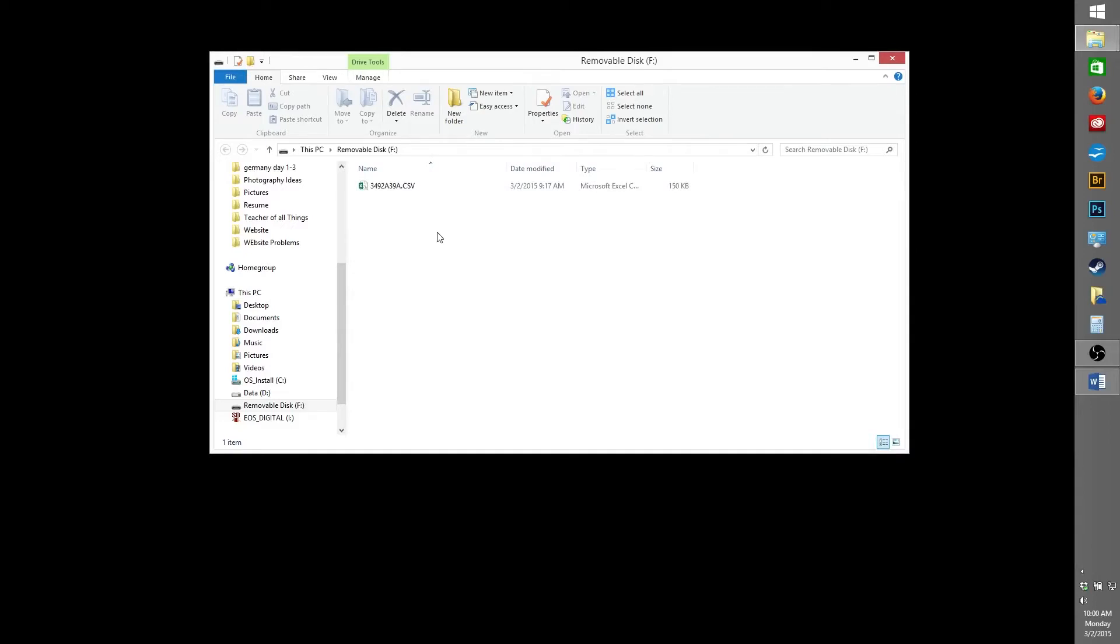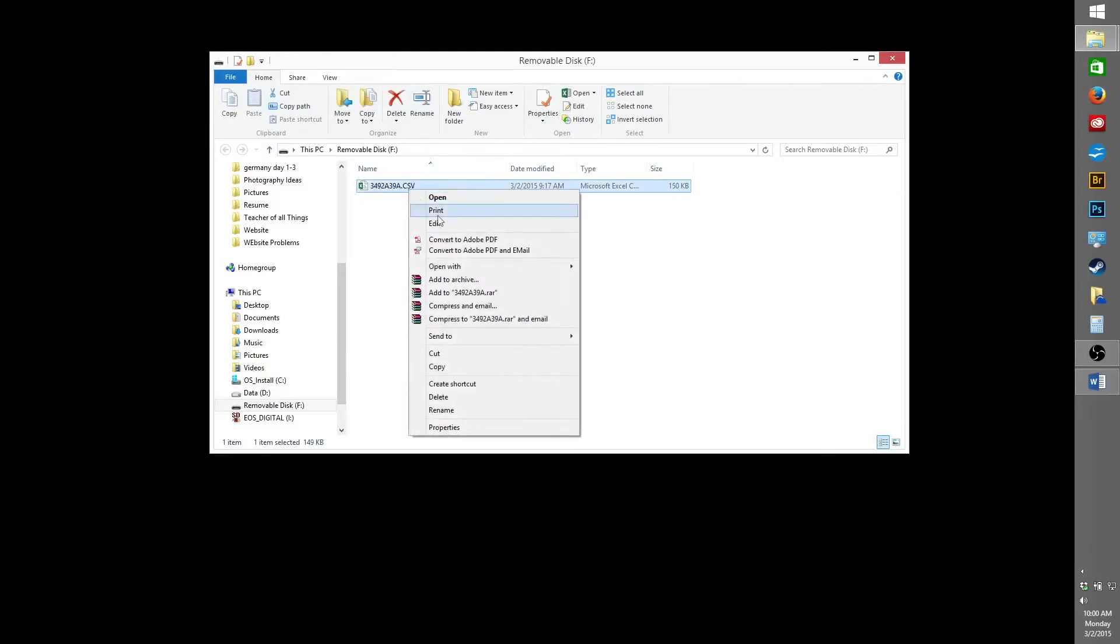Once you're at this folder, find the only file on your USB or the one that looks similar to this one, and double click to open it. Microsoft Excel should open it automatically, but if it doesn't, right click on the file, go to Open With, and then choose Excel.